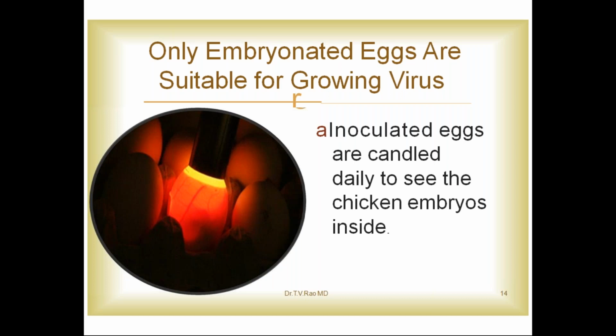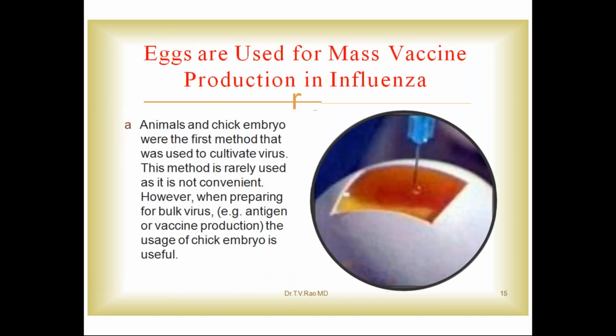We have to do candling and observe the embryo inside daily. Otherwise, we can't do the procedure. The first step is candling.